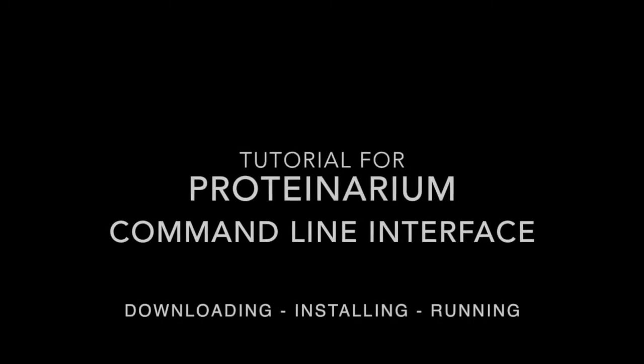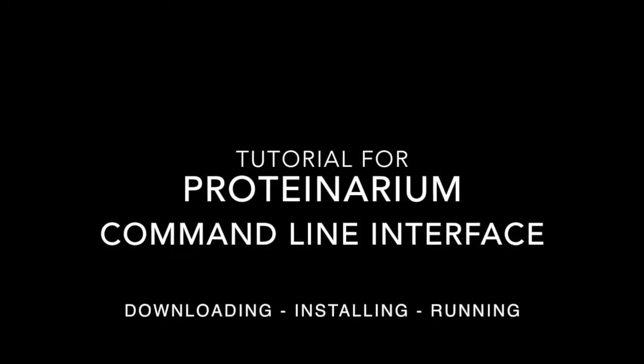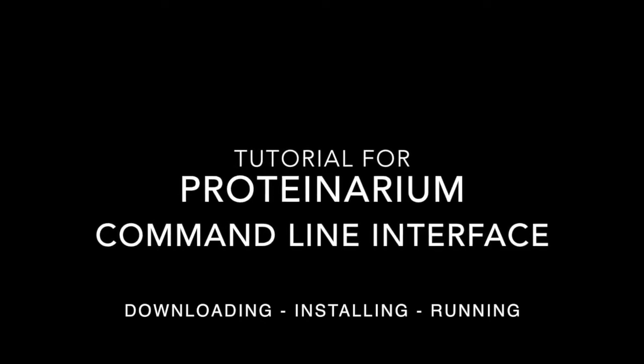In this tutorial, I will show how to install and run the Proteinarium command line interface tool for multi-sample protein-to-protein interaction network analysis.